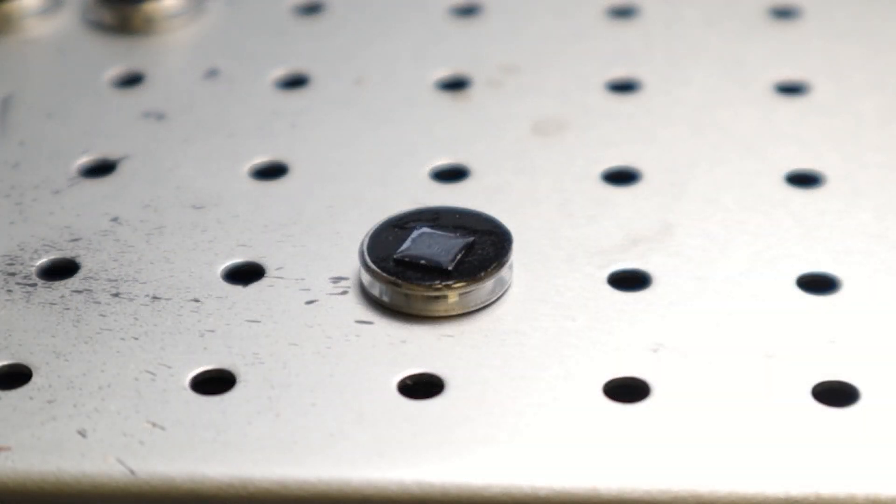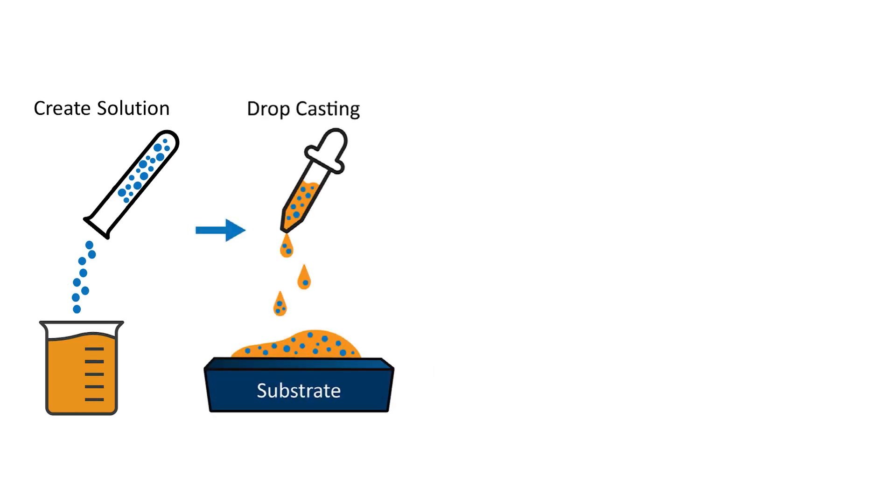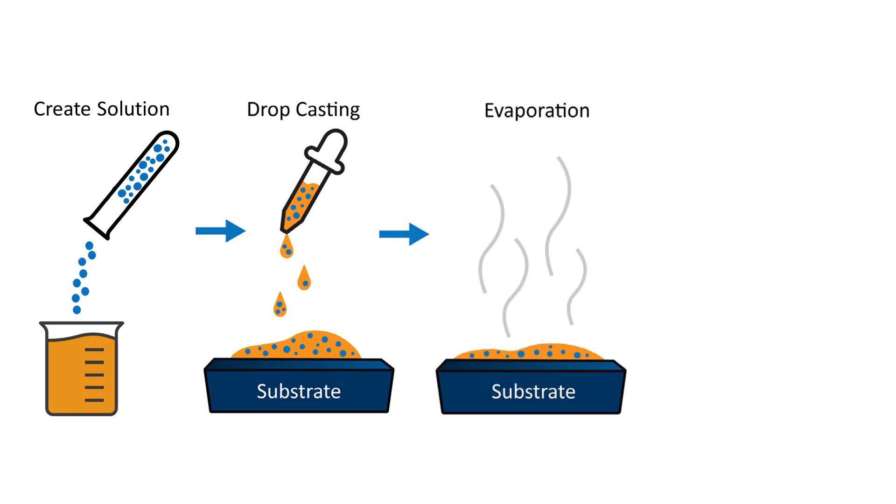The final method I'll be demonstrating is called drop casting, which is used for particles that are less than a micron in diameter. This technique involves mixing a powder into a solvent, most commonly isopropyl alcohol or ethanol, and then casting said solution onto a substrate. The solvent will then evaporate and leave the powder behind, creating a uniform distribution of particles.